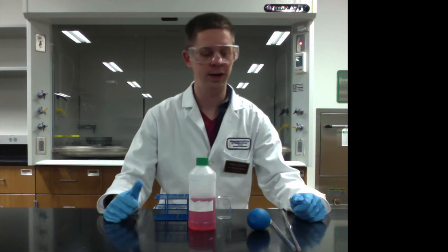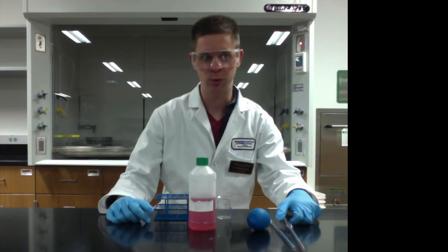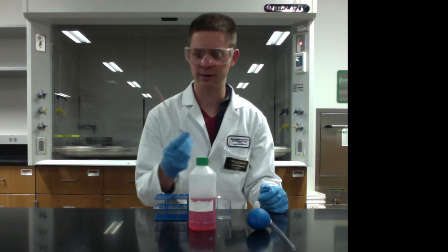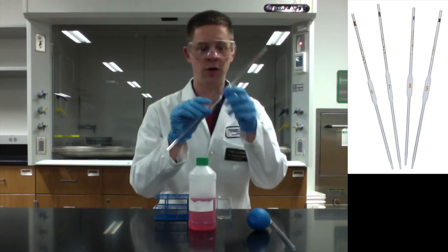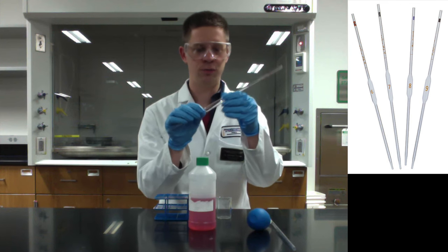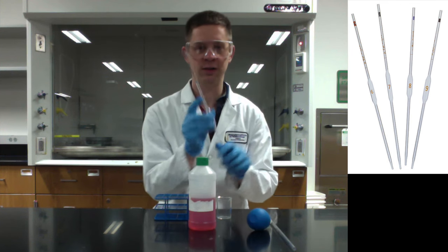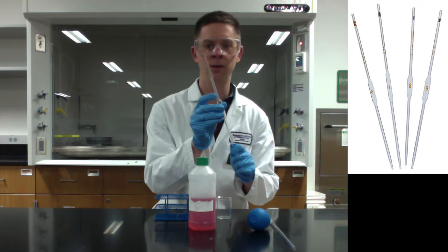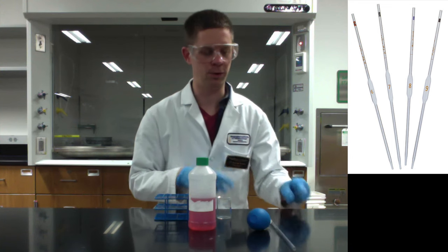First thing to understand is the types of devices that are at your disposal for pipetting. There are two types of pipettes we'll use in general chemistry labs. The first is a volumetric pipet, distinguished by a very large, very bold volume on a central bulb-like projection here. There's a single line on it, a single marking about maybe a third or so or a quarter up the stem above that bulb.